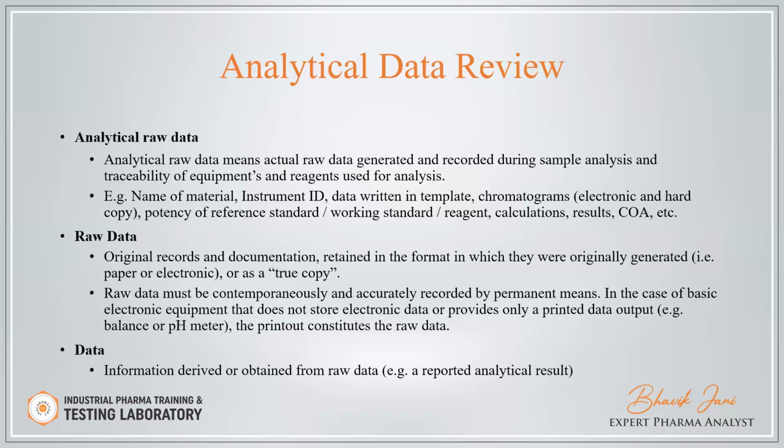So, what is the analytical data review? The analytical data means the actual raw data generated and recorded during the sample analysis and traceability of the equipment and reagent used for the analysis. Likewise, the name of the material, instrument ID, data written in a template, chromatogram, potency, and any detail of the reference standard and working standard should all be available in one report. It's called the analytical raw data.